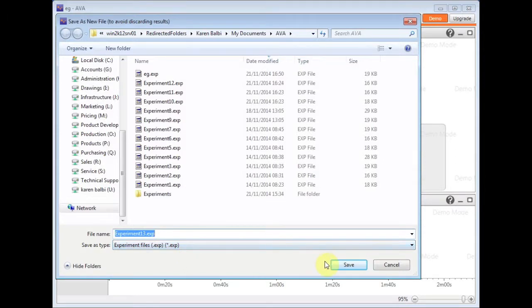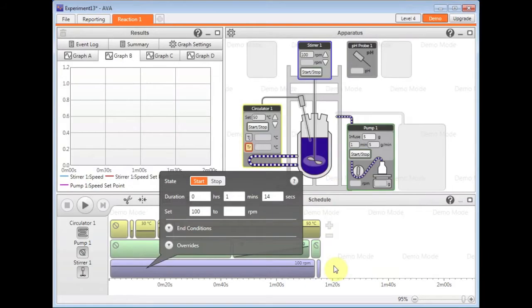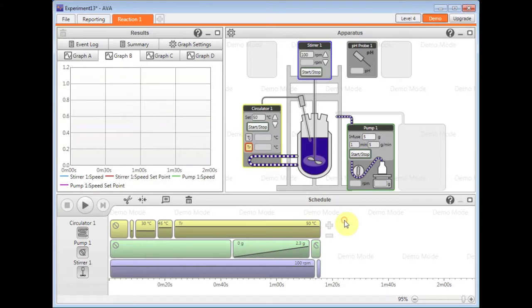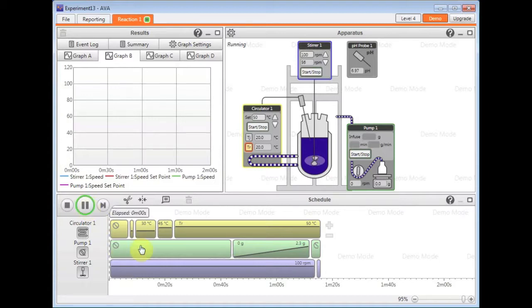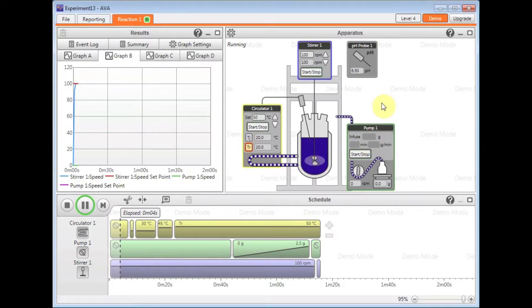Again, I need another experiment name because I've got a new set of data and results. I then click on the play button on the schedule and that will start to make its way through these steps, which it automatically created for me based upon my actions in the apparatus window.